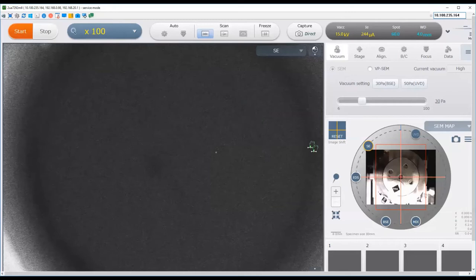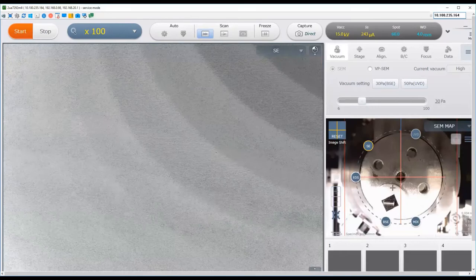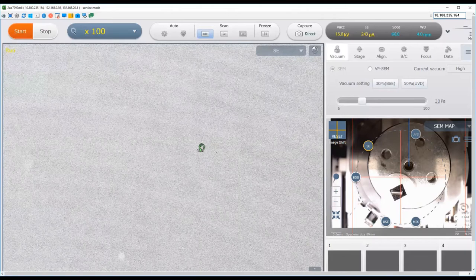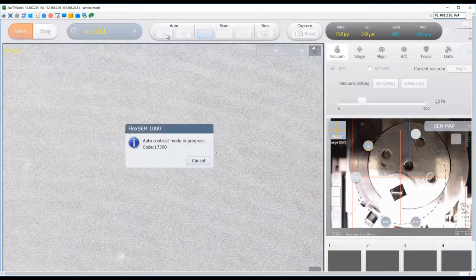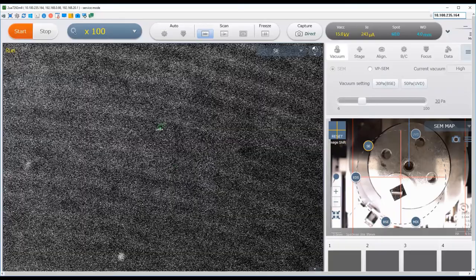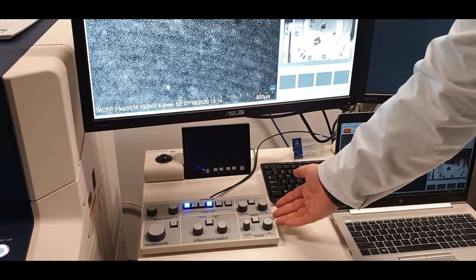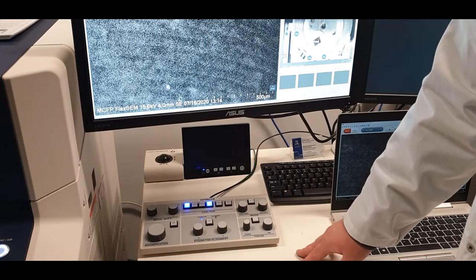You will see something on the screen, but because we're using the pin stub holder, there is a hole in the center where the thread is and our pin stub is over to the side. We need to navigate over towards the pin stub and away from this hole. On this image, you can zoom in to see better, and then single click to navigate quickly to where you want the beam to be. Using the software, you can automatically adjust the brightness and contrast by clicking the button on the panel. The SEM control panel gives you access to most settings and controls needed while imaging.